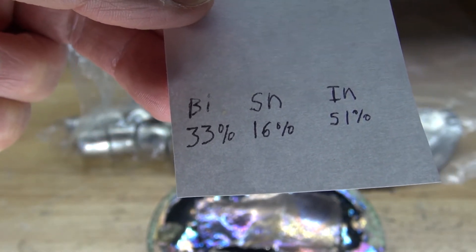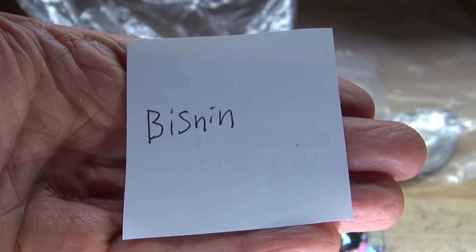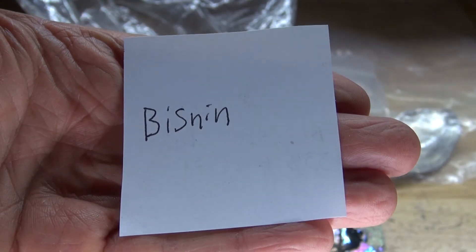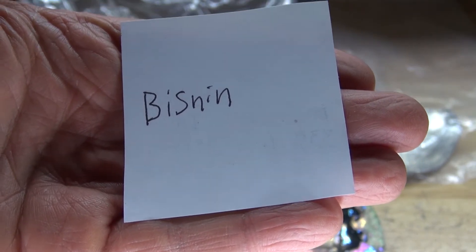You can also weigh out the percentage into grams. I wrote down 'bisnin' because that's the name I would like to call this eutectic alloy, even though it's called Fields Metal, but I like the sound of bisnin better. Just personal preference.